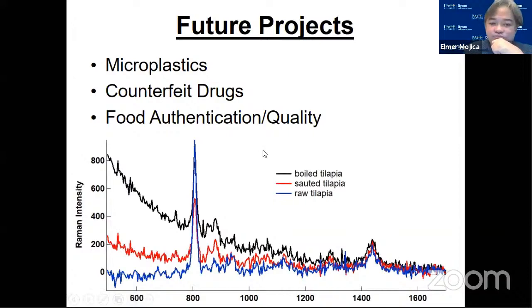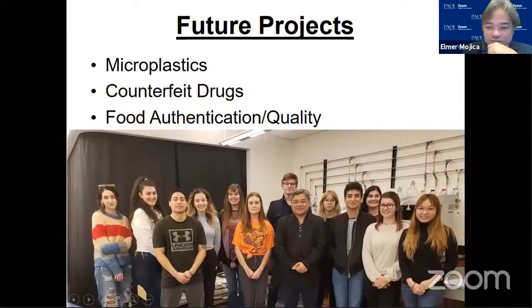Okay, and then I have a student from UP Diliman who did part of her MS thesis. She brought me some seafoods. So we tried to develop, using the portable one, food authentication of quality. So we have here tilapia, with different processing. We try to see, does this really make sense? Okay, so we might use a little more powerful Raman. So I'm thankful that we have this so that I can start doing my proposal to purchase a Raman, because this is the UP student who worked with me.